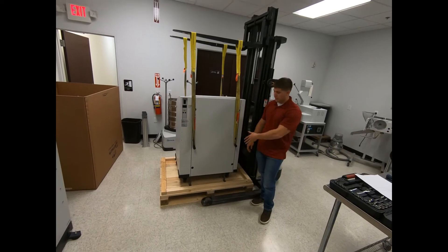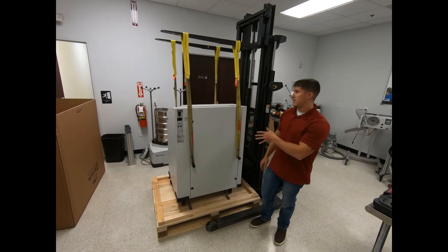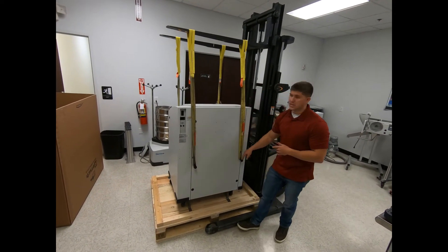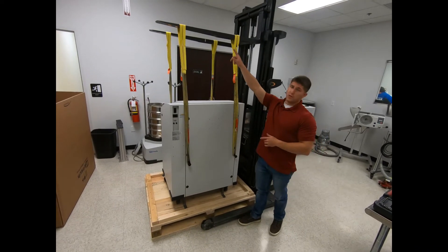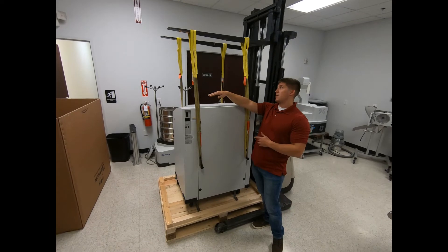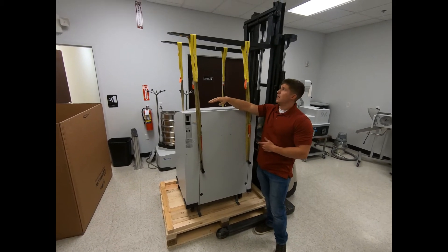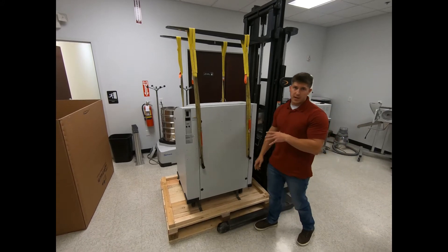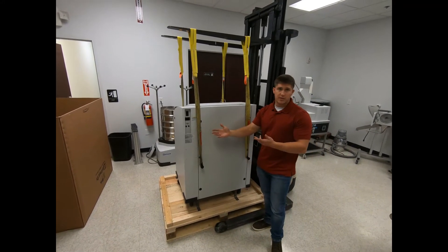Once the shipping bracket is all unbolted, the next step is to attach the straps to the lifting bars located on each side of the unit, directly to the forklift. Make sure you have enough clearance — we recommend about thirty-one and a half inches — then lift the unit up, place it on the ground, and roll it right into the designated area.